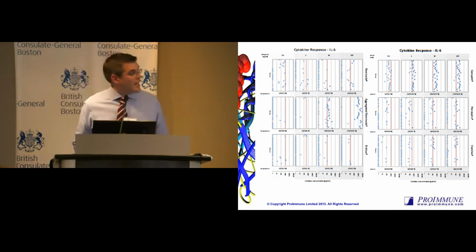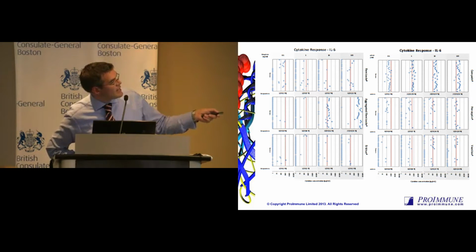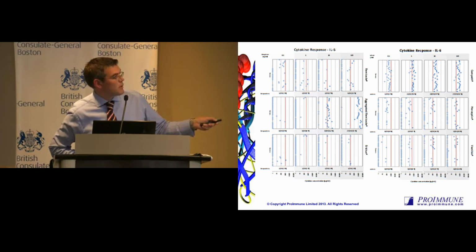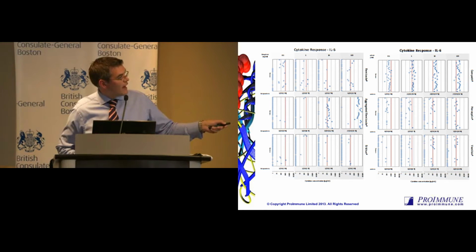We were talking about aggregates earlier. This is, again, just looking at IL-6. But what we can see here is Remicade, aggregated Remicade, which was stir-stressed overnight, and Erbitux, Campath, Herceptin, and Vectibix. The picture is that as you increase the concentration of aggregated Remicade, suddenly you get this threshold at 10 micrograms per mil, where all the donors are suddenly lighting up. And it's this aggregation effect which is causing a strong response and production of IL-6 in the whole blood assay, which is then measured in this multiplexed system that we use.